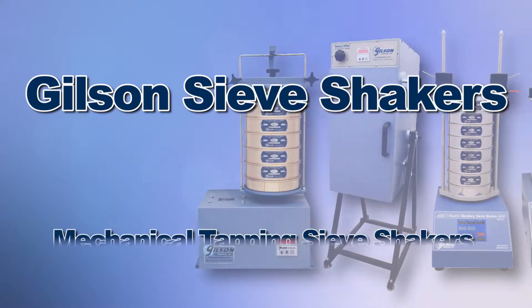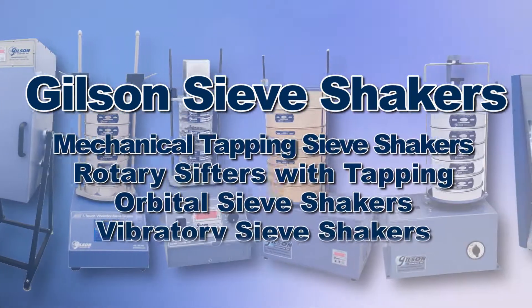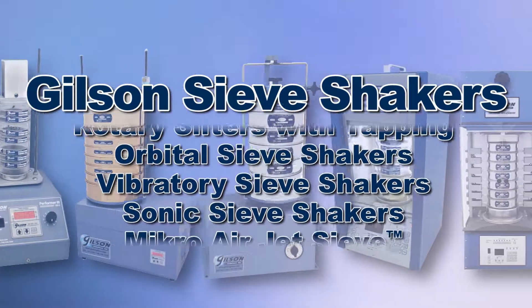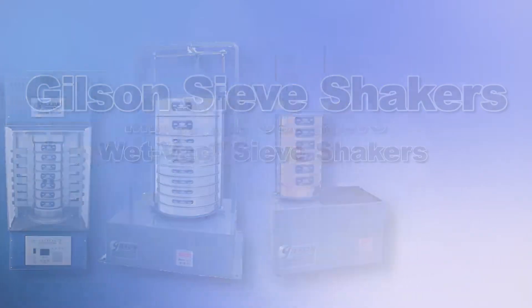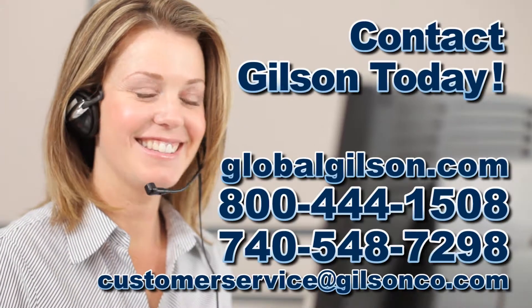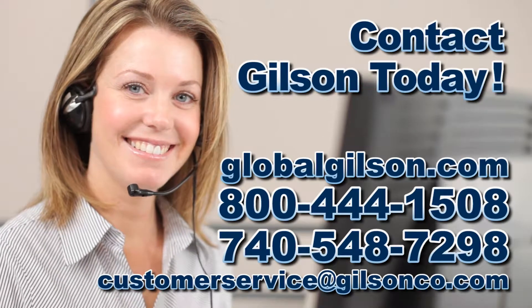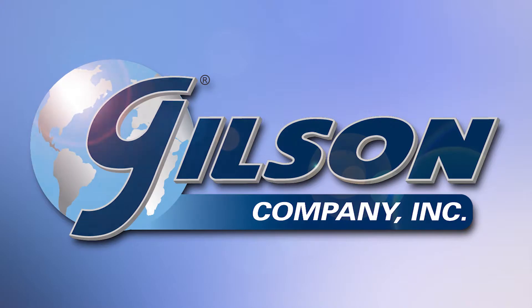Gilson offers these and many other sieve shakers to choose from, with a wide range of performance features and capacities for your fast, accurate, and reliable particle sizing analysis. Be sure to check out all our products listed in the Gilson catalog and on the Gilson website. Gilson — your industry leader in materials testing equipment.